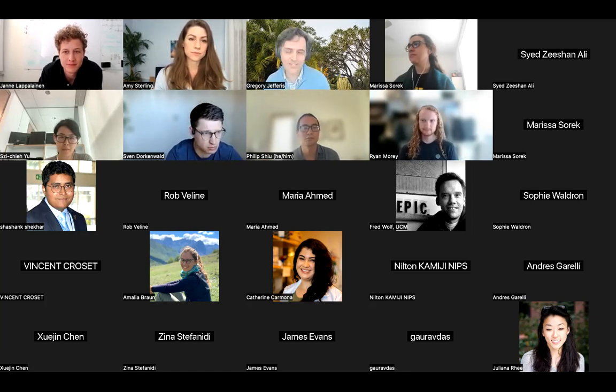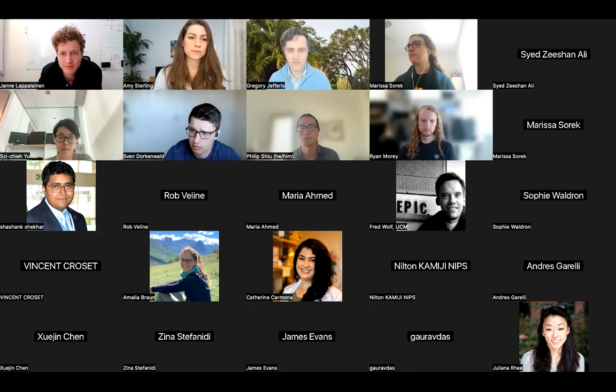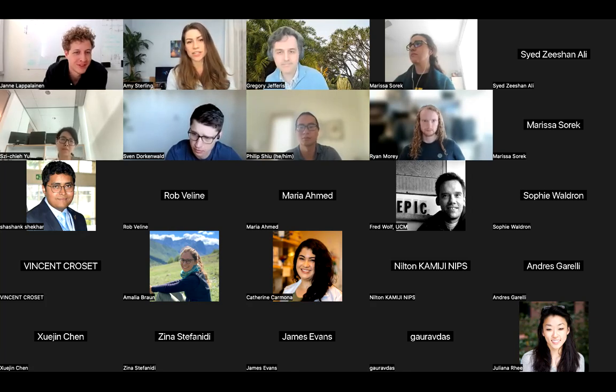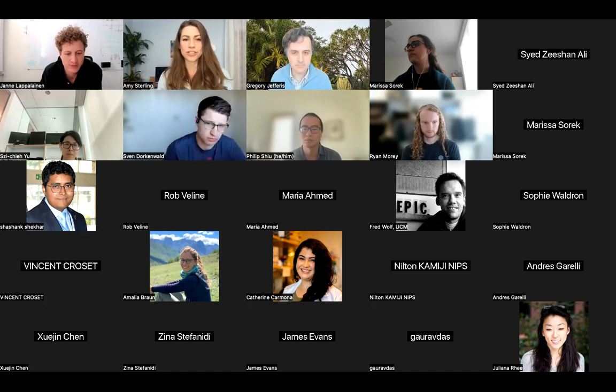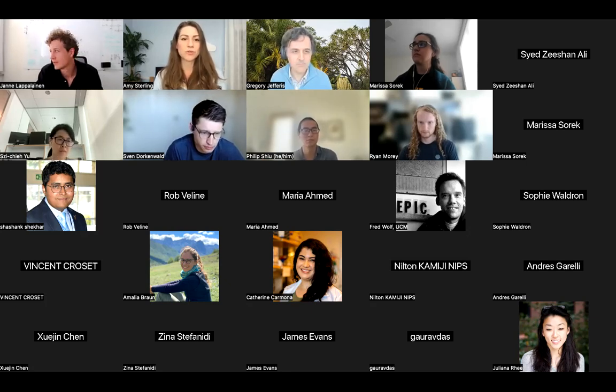I've reviewed some of those, and in general, they look pretty good. But just like the proofreading, they haven't had a second pass in some sense. So whatever you find for community annotations for the optic lobe, there are lots of good ones there, but they haven't yet all had some kind of review by a second party. There is a big effort underway, and I just put a link in chat to this optic lobe tagging dashboard, which we've been using internally for organizing our optic lobe tagging. It'll give you a snapshot of what percentage of at least the columnar types we think have been tagged on both the left and right side.